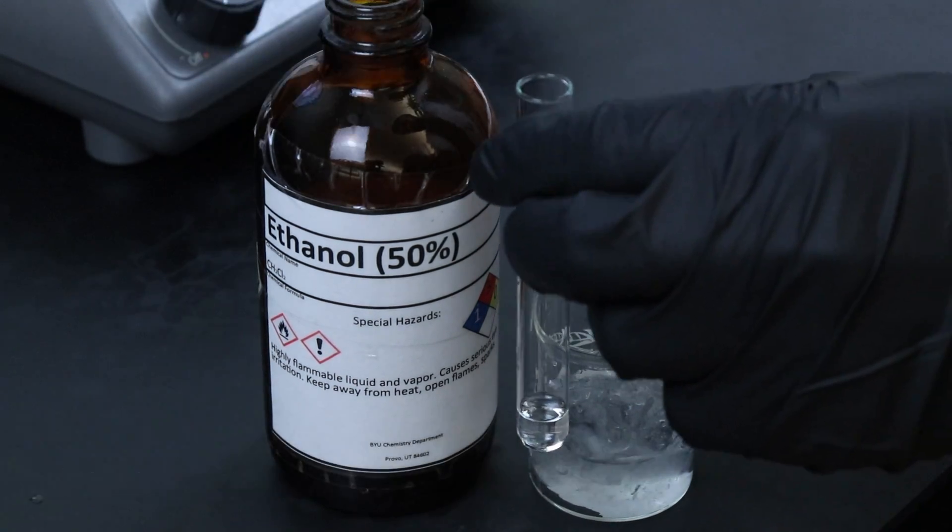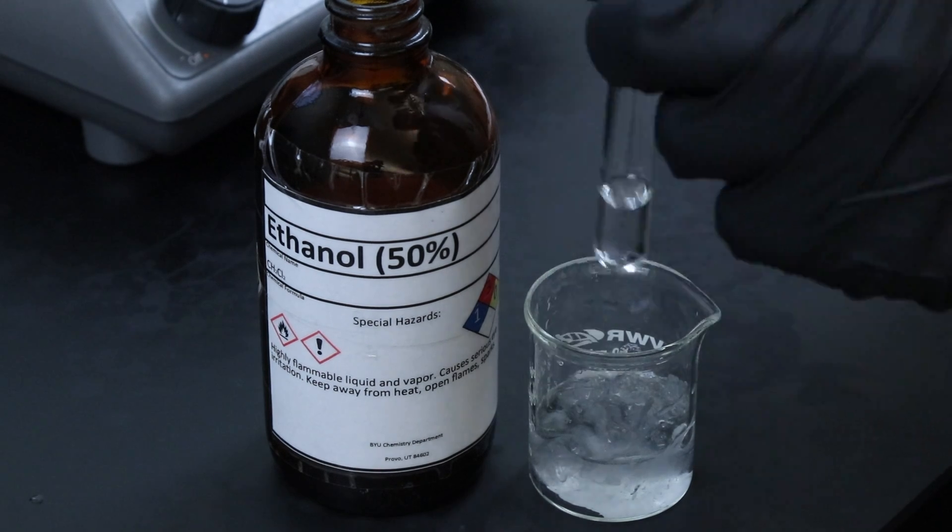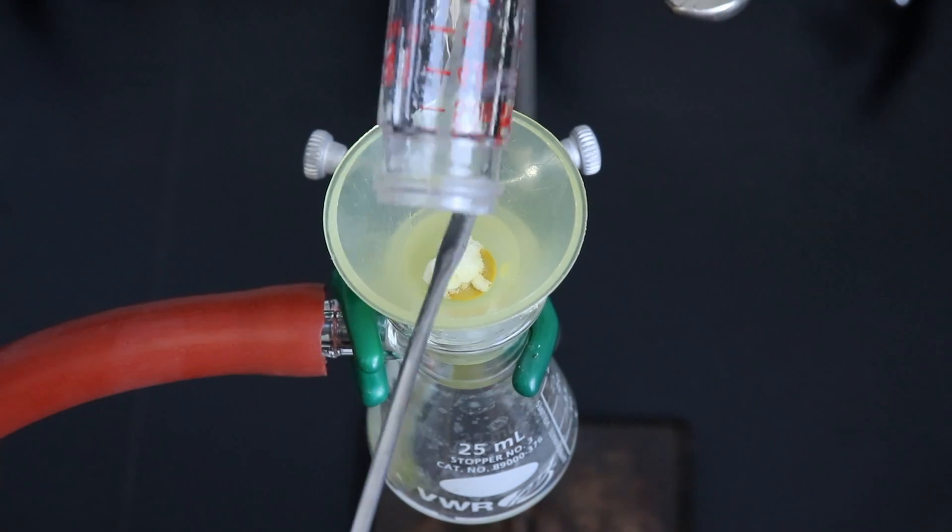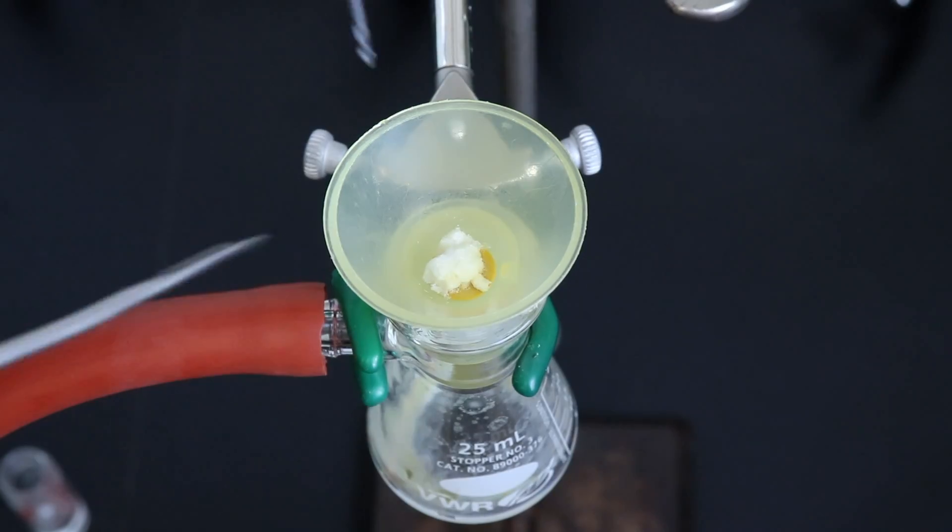I want it cold so that the product doesn't also dissolve and go through the funnel so I'll place it in some ice and then rinse the conical vial with that ethanol and the product that remains as well.